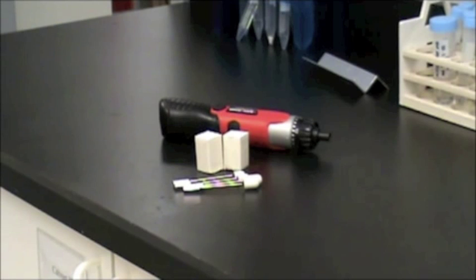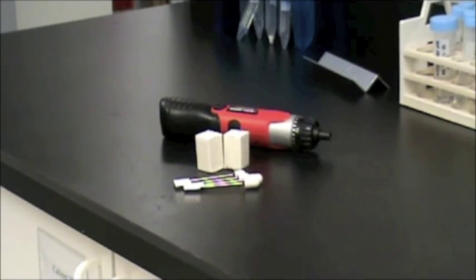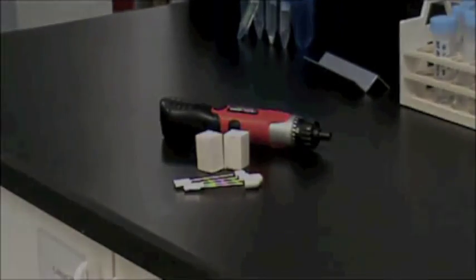The Cryo Grinder is a miniaturized mortar and pestle system that combines the effectiveness of manual grinding with the convenience of a hand-held homogenizer. It is designed for processing small samples and is most effective when the sample is 100 milligrams or less.